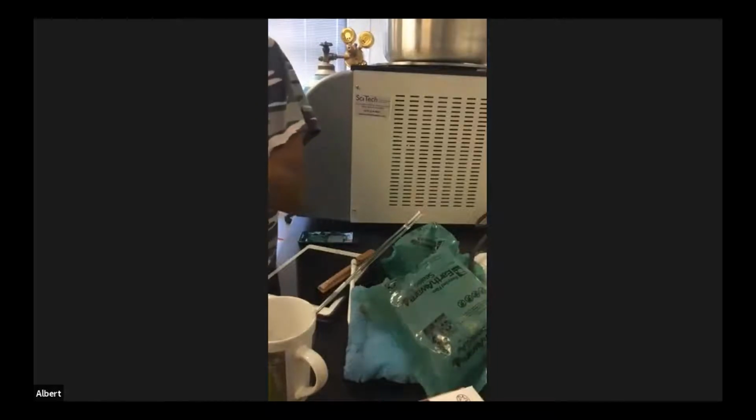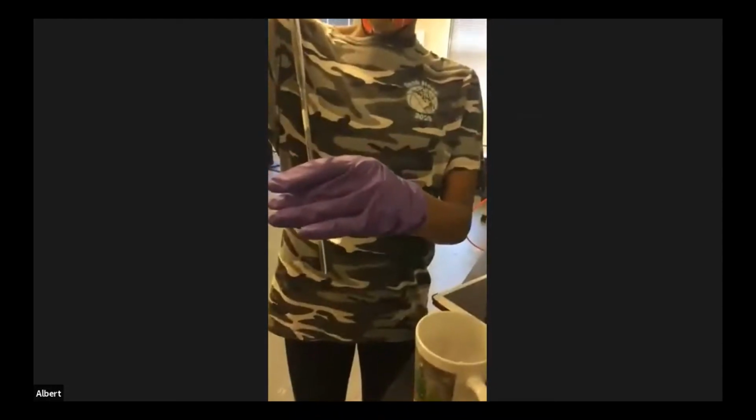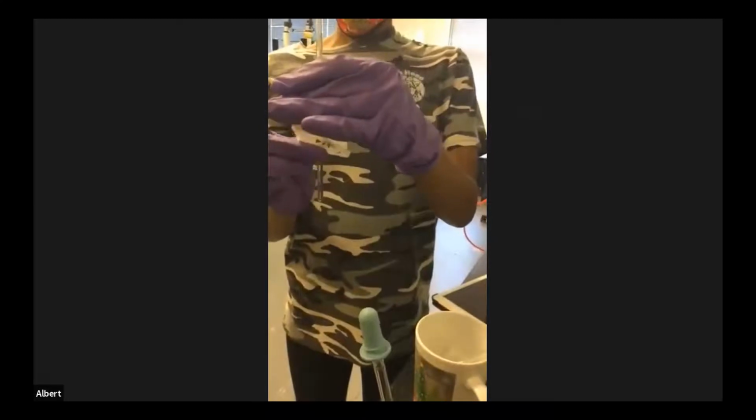All right, just dump it on in there. Is that good? Yeah, that's fine. So y'all see her sample in her hand. Again, you want about 2 centimeters of solvent. So hopefully y'all can see that. So that's fine. And I think this is the crude.